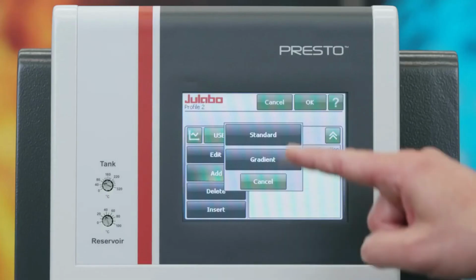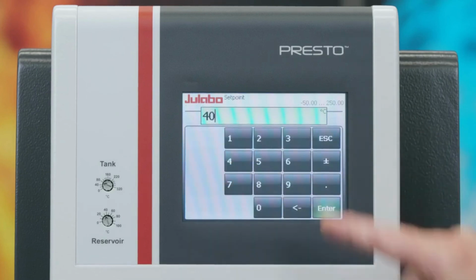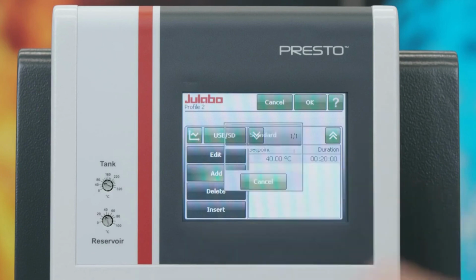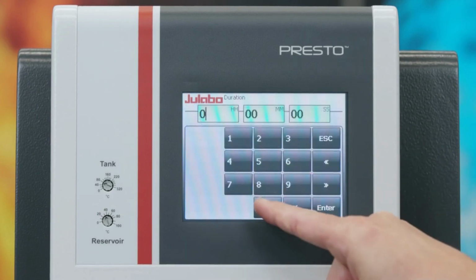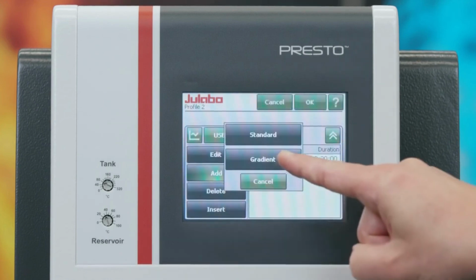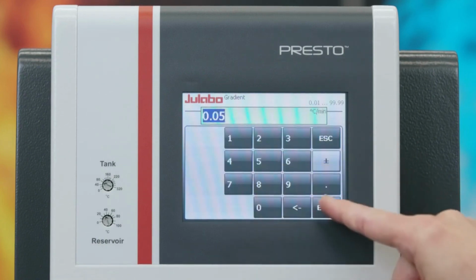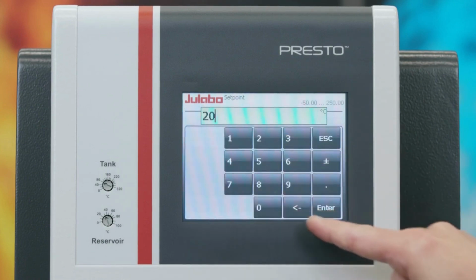period. For our first step, we choose standard with a set point of 40 degrees, which should be reached in 20 minutes. For our second step, we want to reach a set point of 50 degrees in 10 minutes. For our third step, we choose gradient with a set point of 20 degrees and cooldown with a speed of 0.05 degrees per minute. Our final step will keep this temperature at 20 degrees for 1 hour.